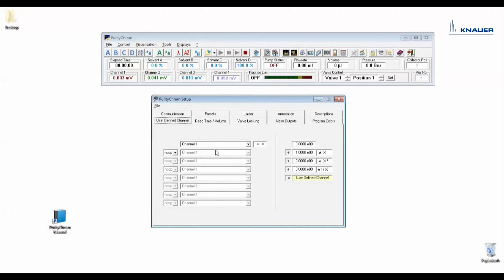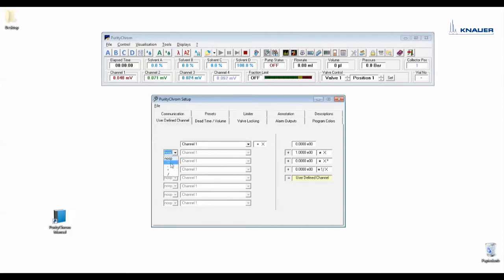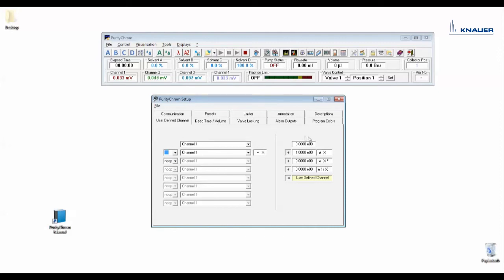Here you can define a user defined channel. For example if you have two pressure monitors before the column and after the column then you can enter here the two pressure channels and subtract them from each other. And then the software would show you the pressure over the column as user defined channel.